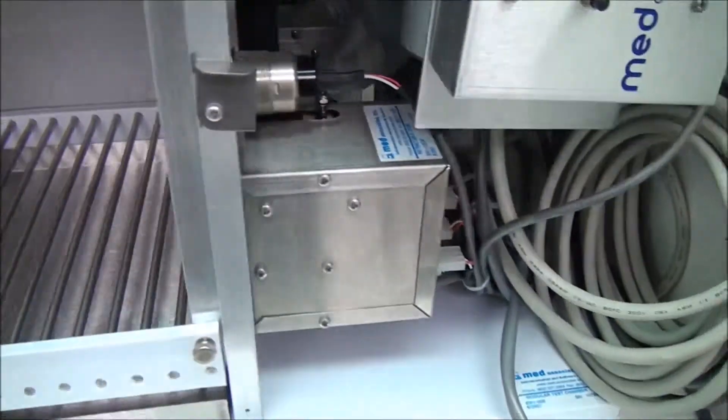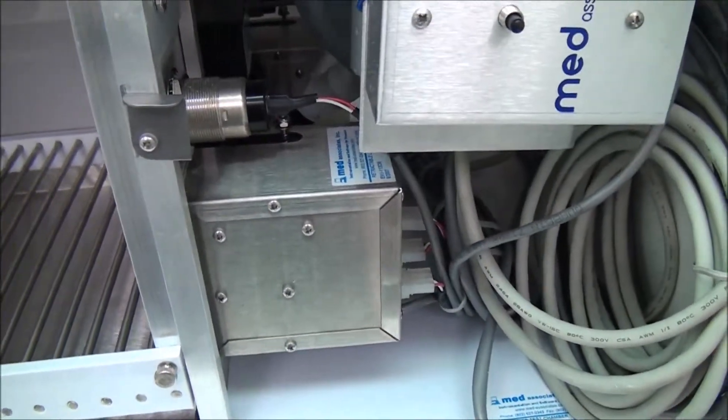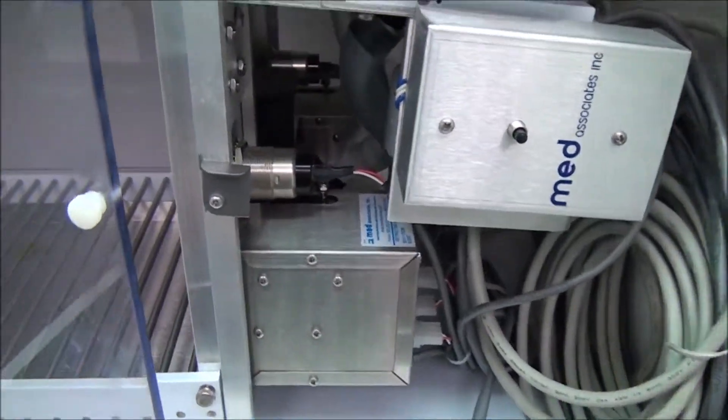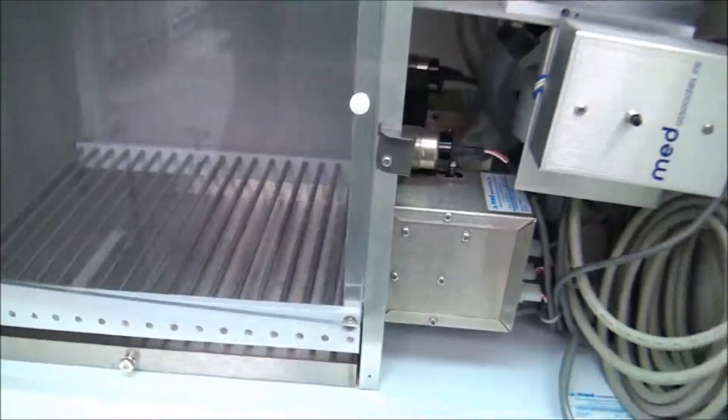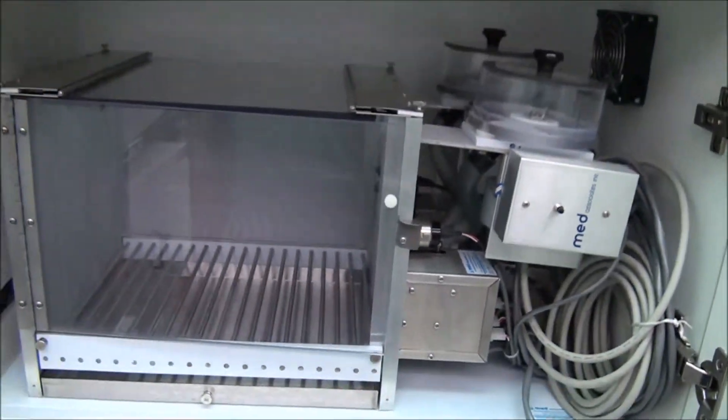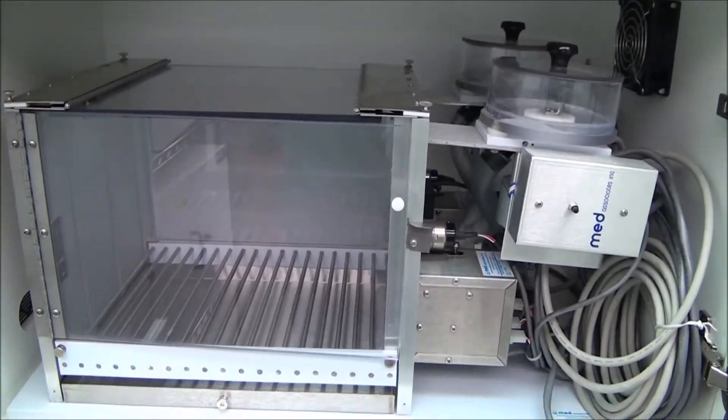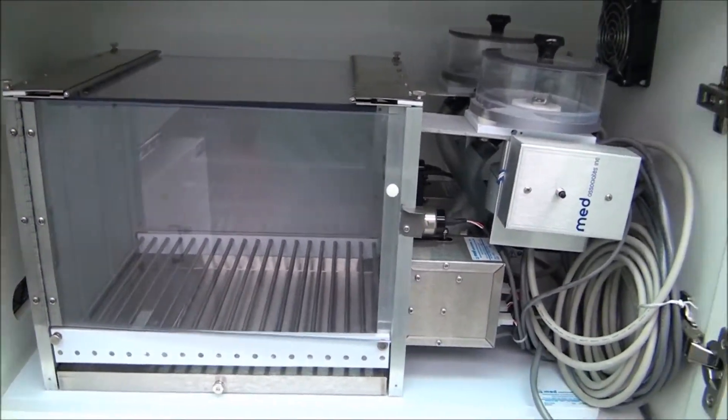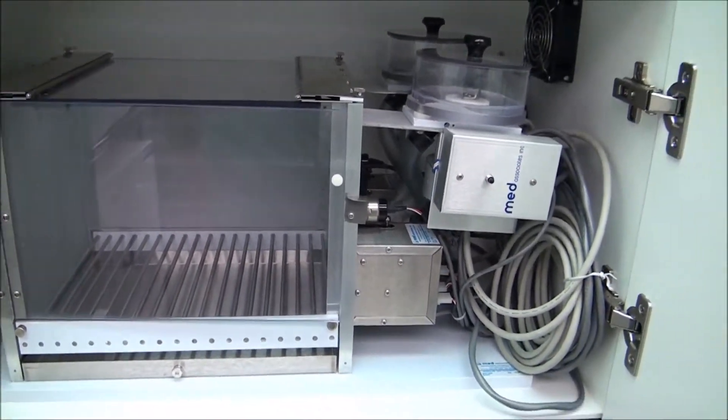But like I said, many options, many different configurations you could program this for, for monitoring and evaluating the rodents. This is for rats.